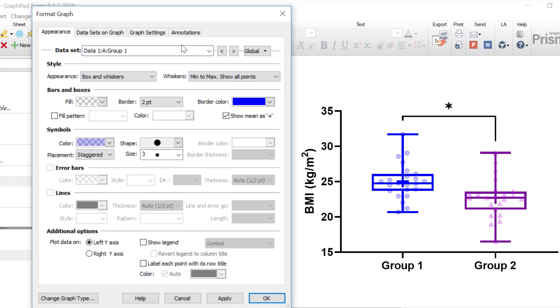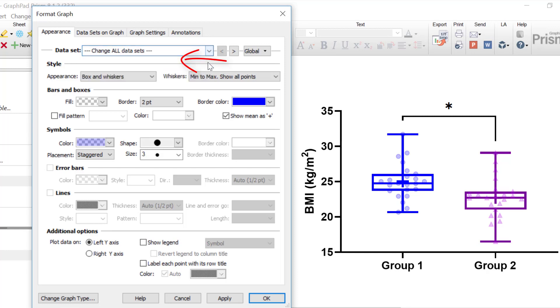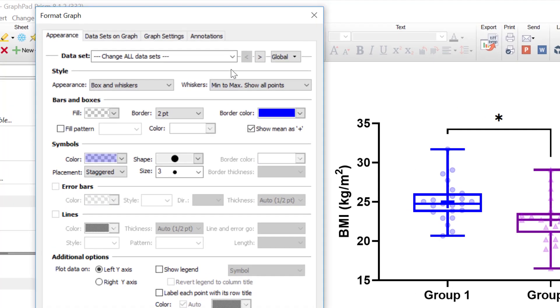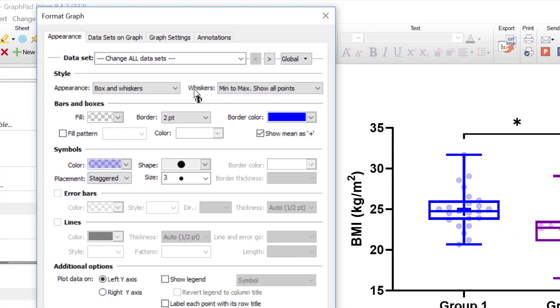In the top drop down menu, under Datasets, it is possible to select the data set that you want to customize. Alternatively, the option at the top, which is Change All Datasets, with this option selected any adjustments that are now made will be reflected on all of the data sets on the graph. You know the global settings are active when the globe icon appears next to the cursor.